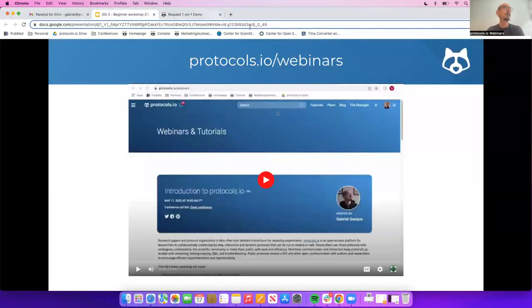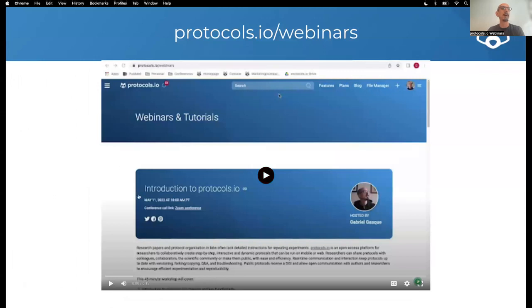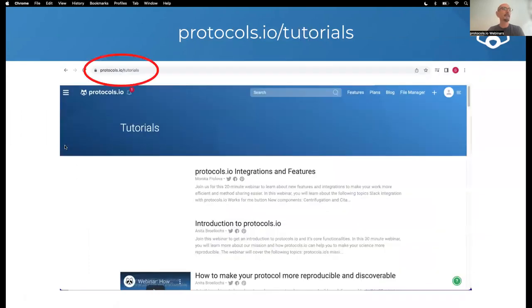So I'm going to go back to my slides, which, as I mentioned before, I will share with the attendants at the end of the webinar. So let's keep moving.